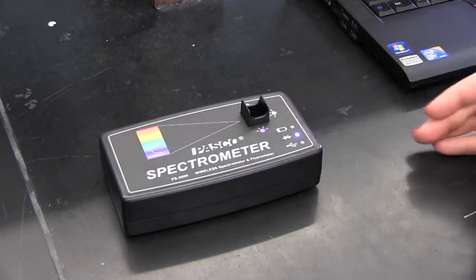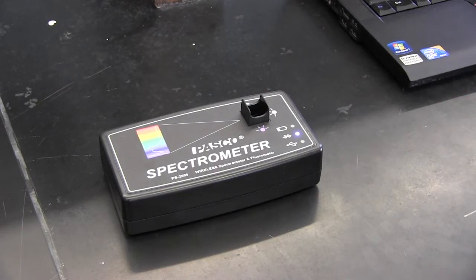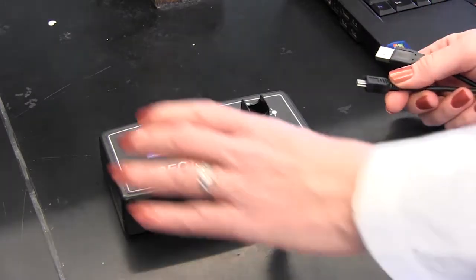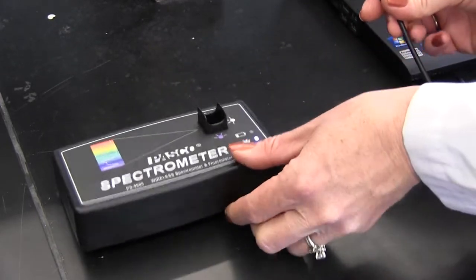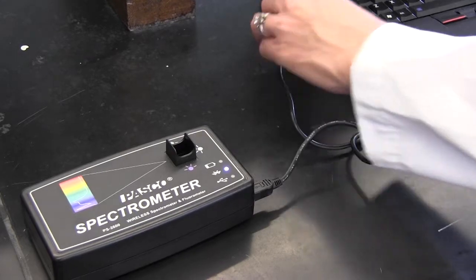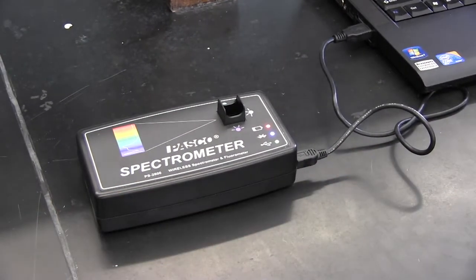So now the spectrometer is on and if you are going to be using it with a computer, you will connect it to your computer using a USB cable. So you plug it in there and you'll also plug it into your computer and your computer will automatically install the device software.